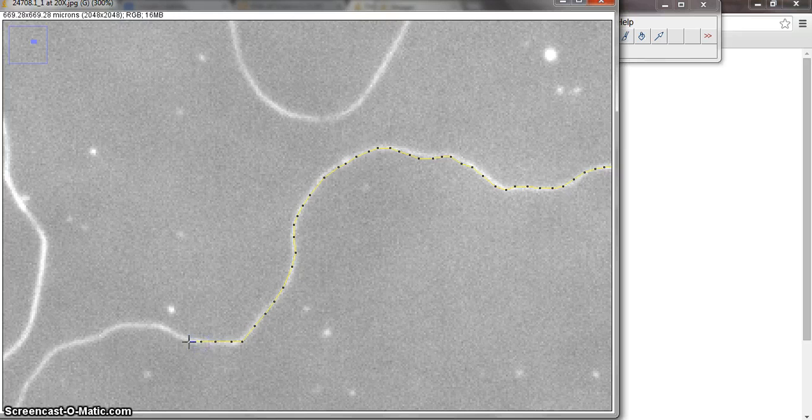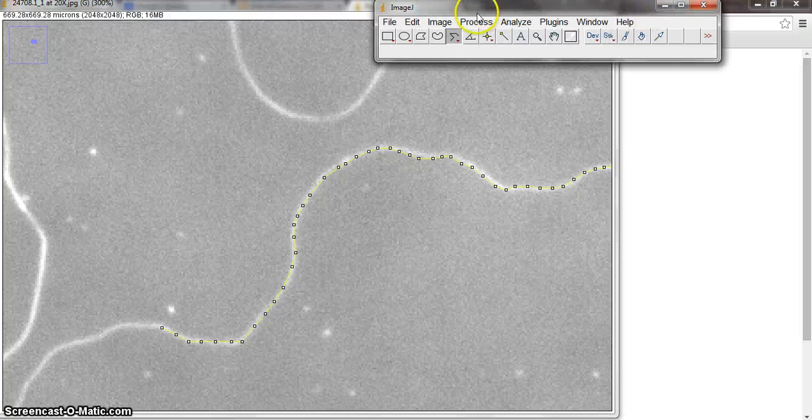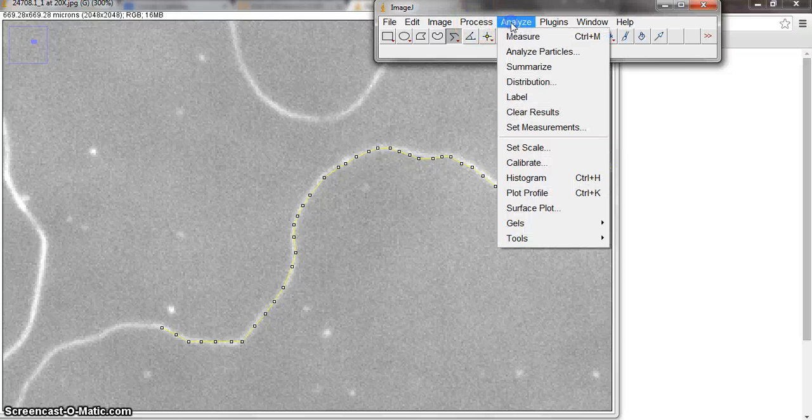So let's just say I stop here. I can hit Control M. So I'm going to move this over here and I'm going to hit Analyze.